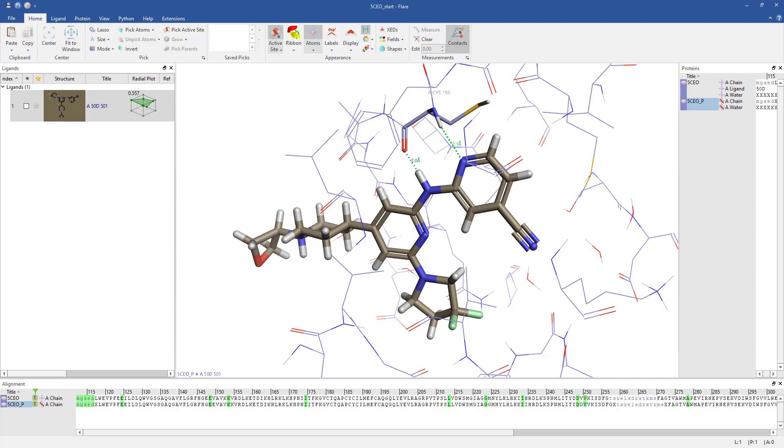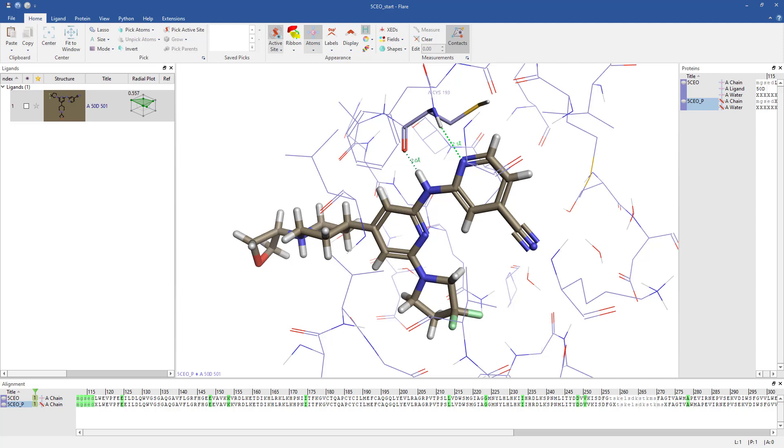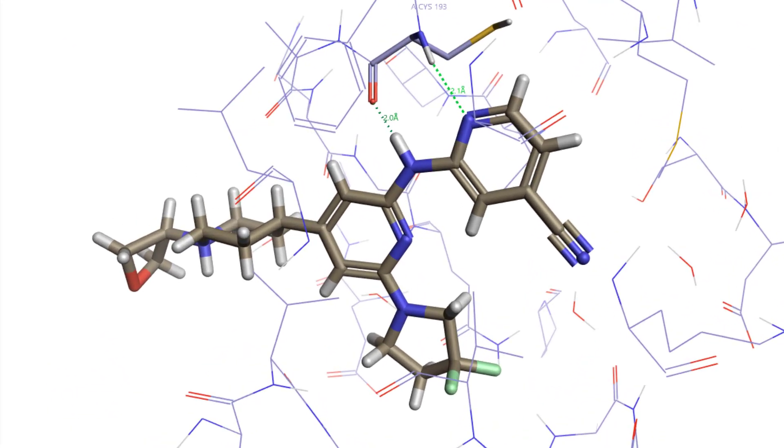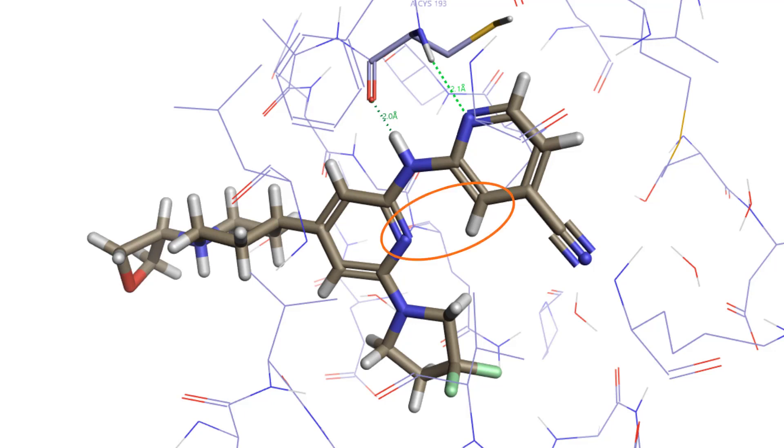I have opened PDB Entry 5CEO in Flare and prepared the ligand and protein structures. The ligand is a potent and selective dual leucine zipper kinase or DLK inhibitor, but it has poor physicochemical properties leading to high free unbound clearance. It features an intramolecular interaction between the aminopyridine CH and the pyridine core nitrogen which maintains its rigidity. It binds to the protein via two H-bonds to cysteine 193.